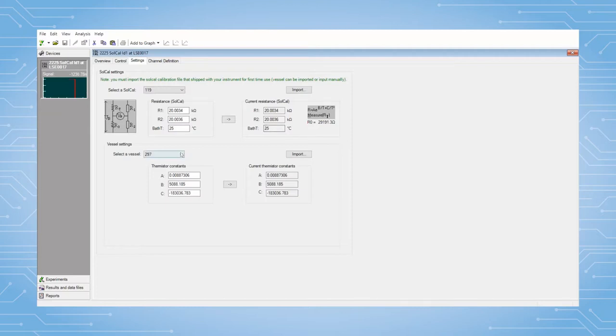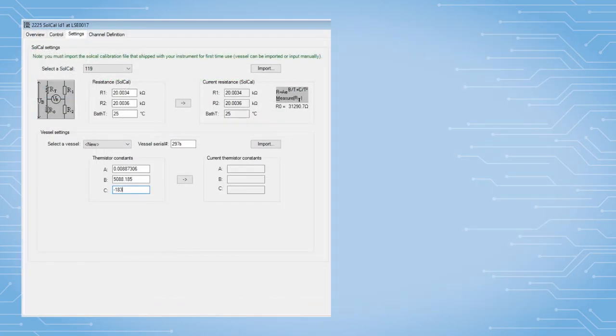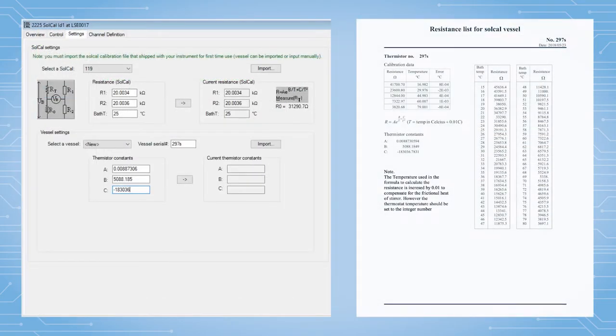If needed, the vessel device file can be imported into the software by pressing the import button, or it can be created by entering the values from the SolCal vessel resistance list that is supplied with the SolCal vessel.